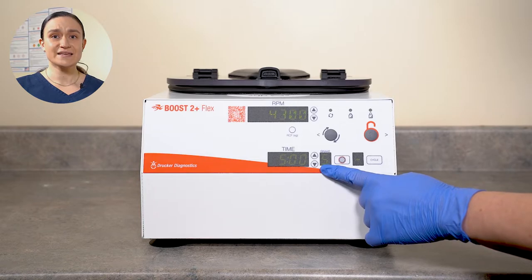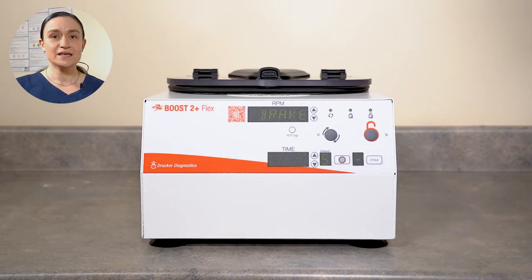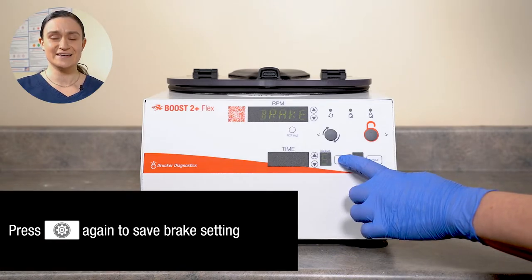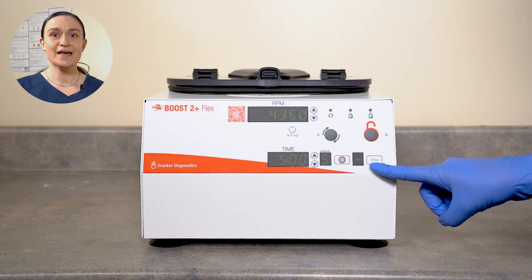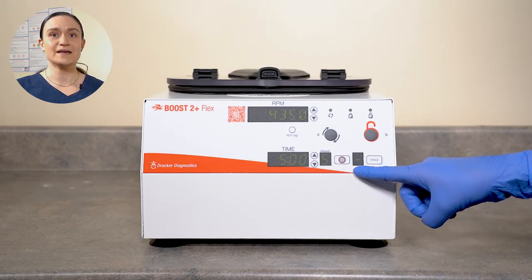To the right of the Time screen, we have our brake setting indicator. Brake values on the Boost 2 Plus Flex range from 0, which is no braking at all, to 9, which is maximum braking. In order to adjust the braking level, press and hold the menu button located to the right of the brake screen. You will see the word 'brake' show up in the RPM screen at the top of the centrifuge. You can adjust that braking number using the up and down arrows next to the time screen. Once that number shows as desired, press the menu button again to save and exit. To the right of this, we have our cycle indicator, which shows the number of the currently selected cycle, or a dashed line if no saved cycle is selected.